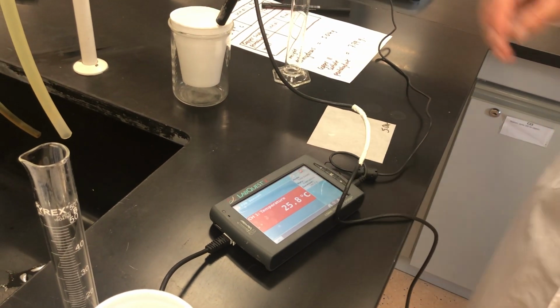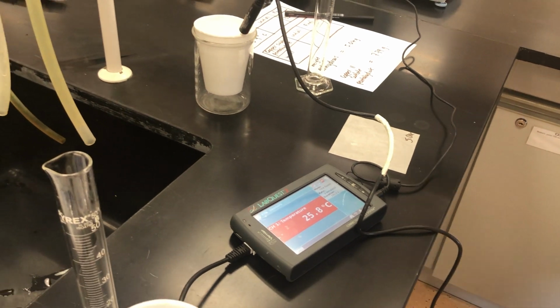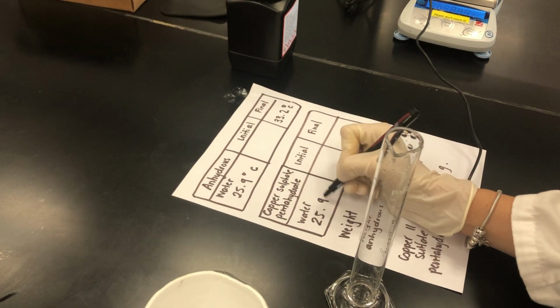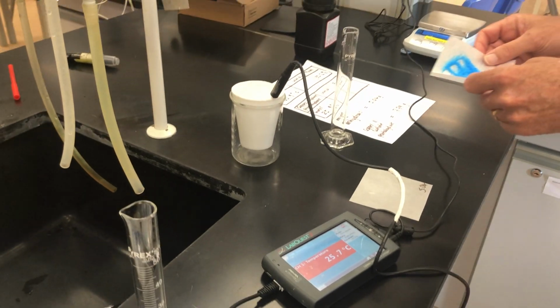Yeah, so there's 25.9. Okay, let's write that down on the table. So it's 25.9? And now it's dropped to 25.7.